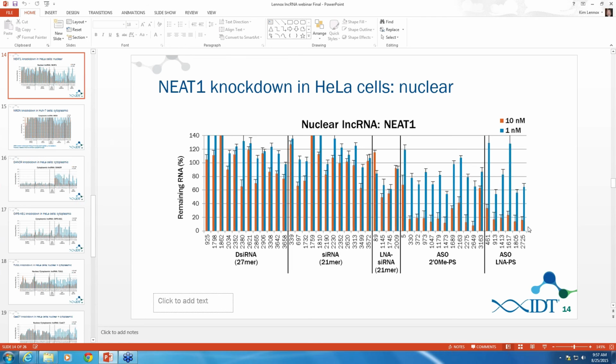Somebody is interested in the lncRNA fast response, that early response that you get, for example, in like 30 minutes. Should we start the knockdown 24 hours ahead of time, even when the lncRNA is not expressed? So can they introduce their reagents before the event that's going to trigger their lncRNA expression?